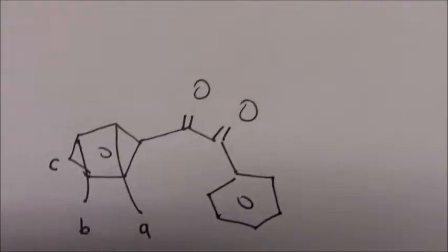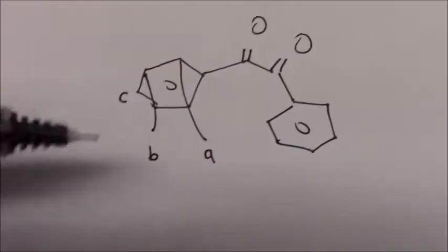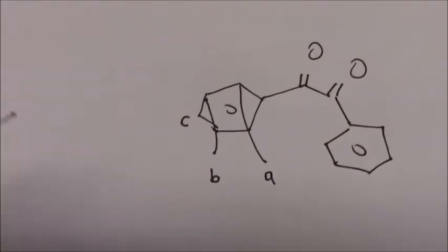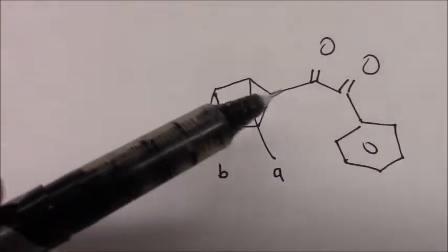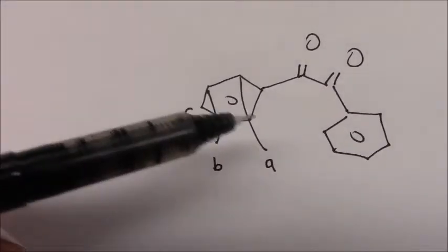Moving on to the product, benzil. Now, obviously, this looks like it has quite a bit of symmetry. This is the hydrogen NMR, so the only hydrogens are A, B, and C. Oftentimes, the one that is ortho to the carbonyl should be furthest to the left, and because it's symmetrical, you'd say this is 2 and this would be 3.